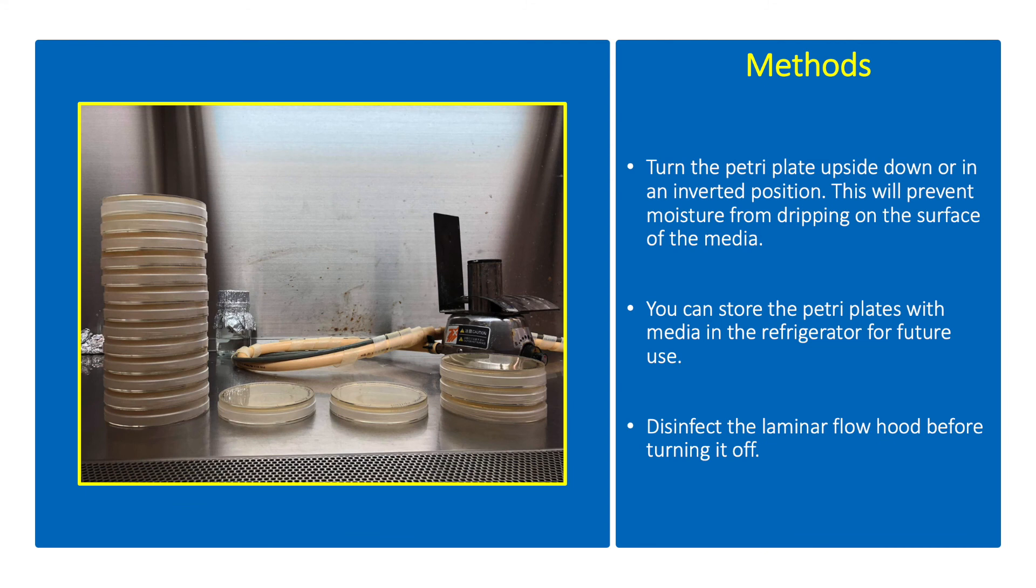Turn the petri plate upside down or in inverted position. This will prevent moisture from dripping on the surface of the media. You can store the petri plates with media in the refrigerator for future use.